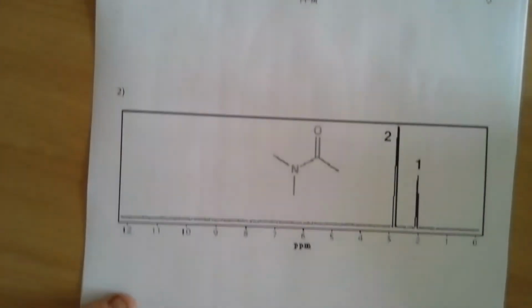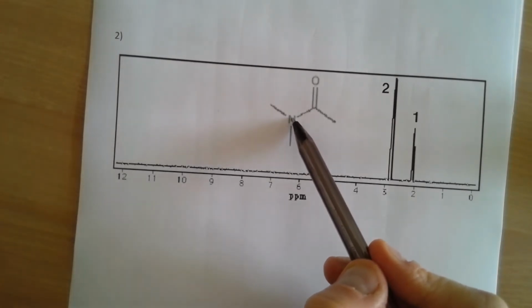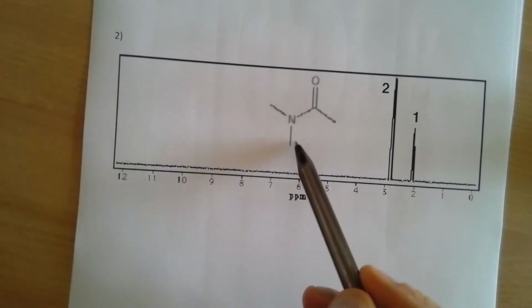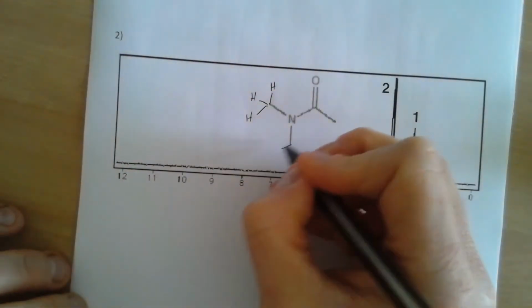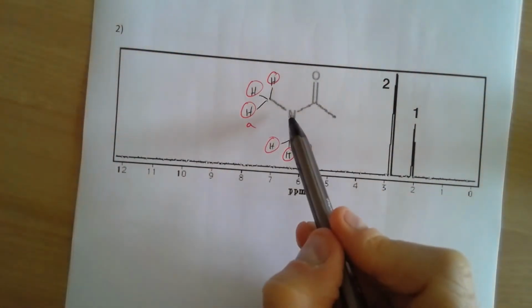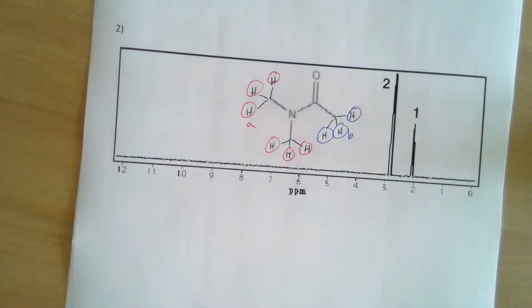Let's have a look at example number 2. So again, this was some example that we saw with carbon NMR. Hopefully we recognised or remember that there is an axis of rotation around this nitrogen atom. That means that the hydrogens attached to here and here are equivalent to each other. So if we draw these out, then it's fair to say that all of these can be labelled as environment A. There's obviously no hydrogens on there, no hydrogens on there, which means that there's only one other hydrogen environment, which is this one here, which we'll call environment B.